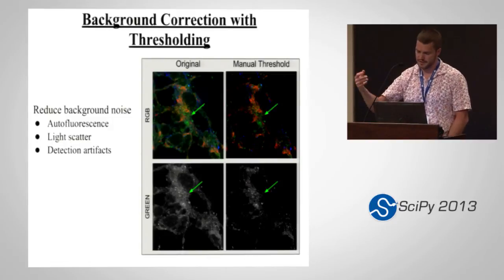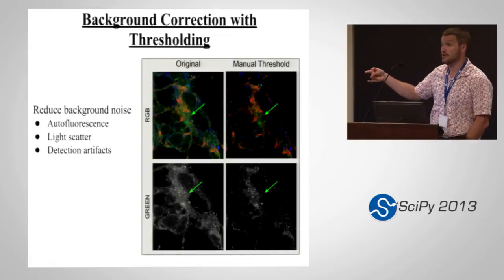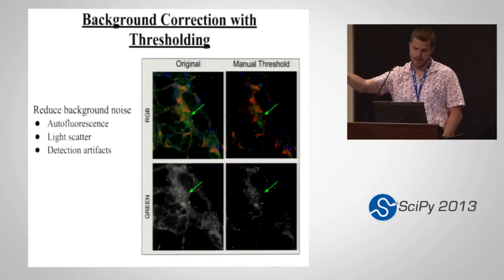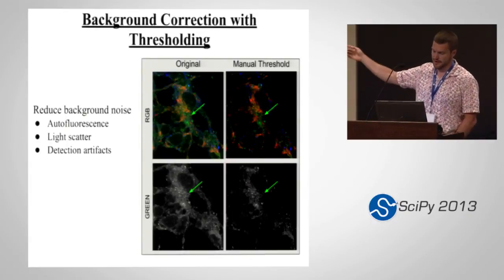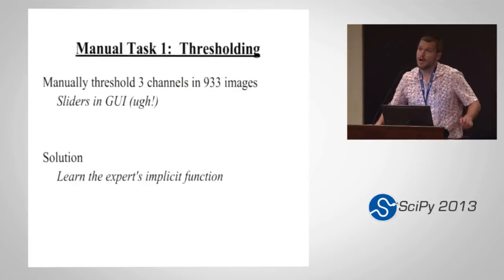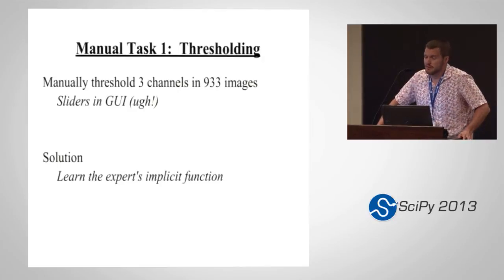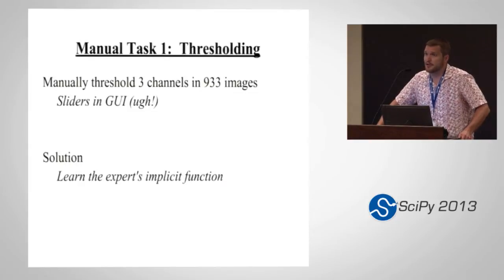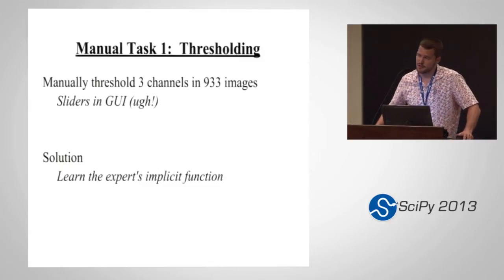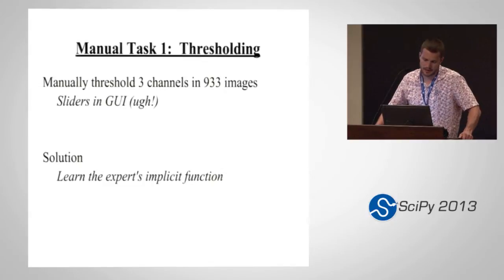We have an extra source of noise in the green channel that needs to be dealt with. The arrows indicate a location with low-level green channel background noise. This is a conference about scientific Python, and how did we end up using it? It turns out that manually thresholding 933 images — the number we developed in the course of our experimentation — on three channels means approximately 2,700 rounds of thresholding, which is not appealing to a biological scientist.